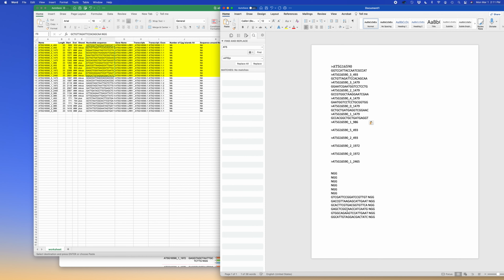Sometimes you just have to do the long way to get the format that we need. And you may not need all of them. You can probably select 3 or 4, around 2 to 3 around each one. I'm just doing it this way to demonstrate what we can do.